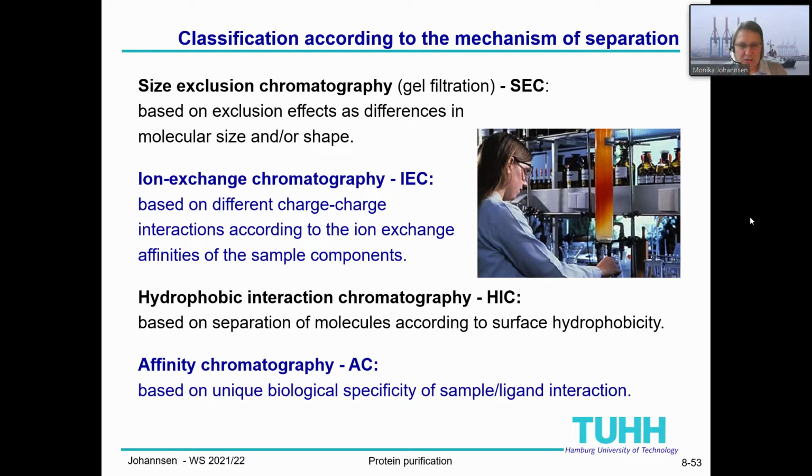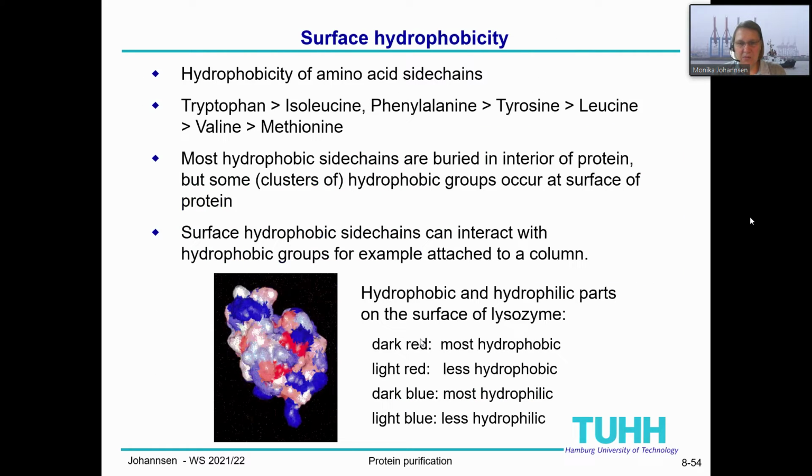Okay, so the third of these 4 very important separation methods for proteins is the hydrophobic interaction chromatography. This separation is based on the surface hydrophobicity of the molecules.